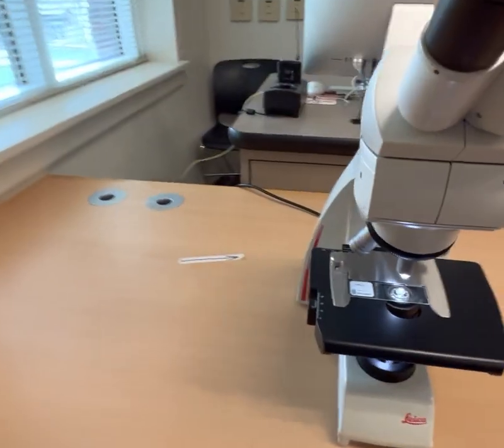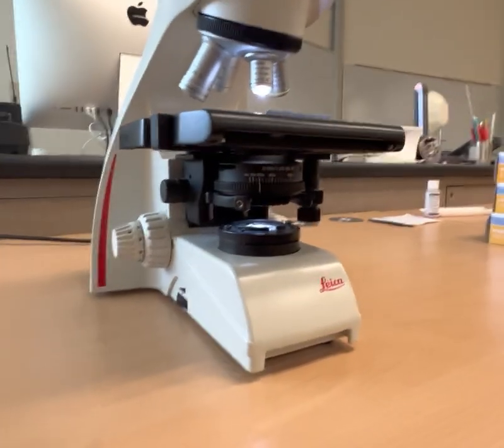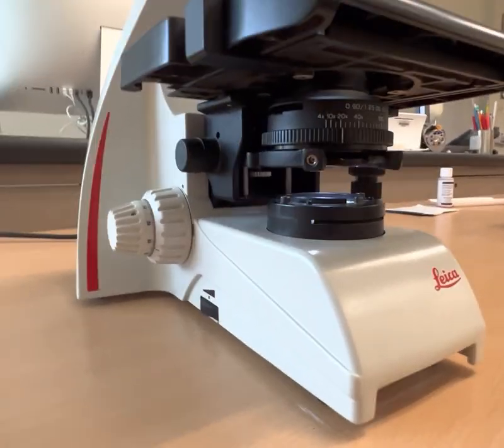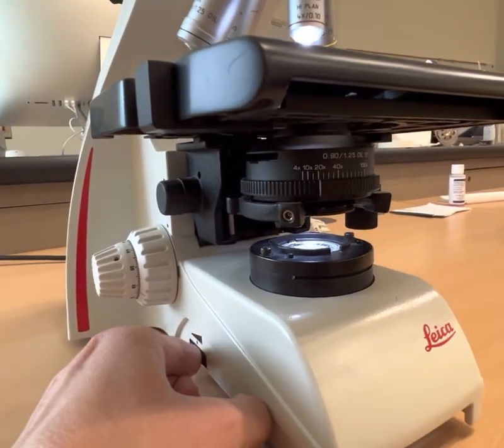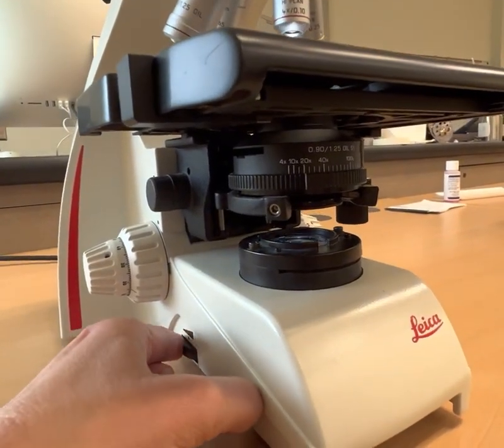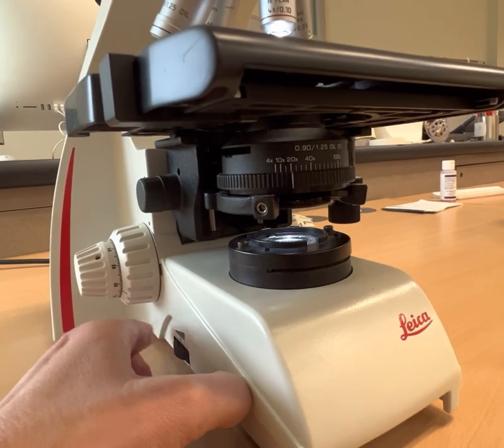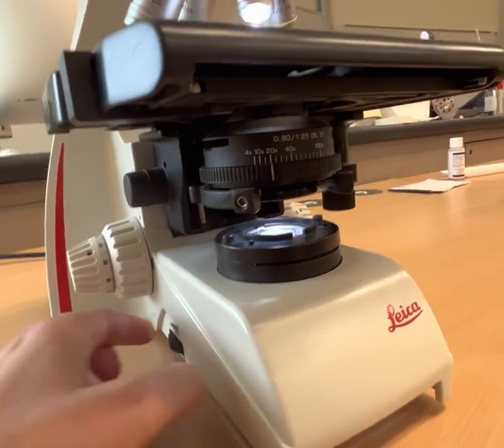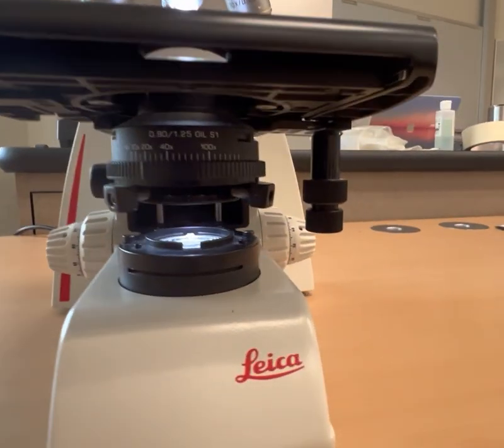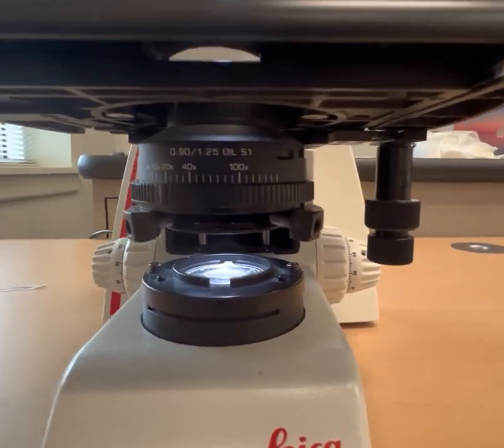Over here, I want to show you something else. So my microscope can adjust the light, and yours may be too, but I can make my light dimmer or I can make it brighter. So depending on the conditions on the slide and the room, I may want to fiddle with this so I can see things a little bit better. Another thing I may want to play around with is this.